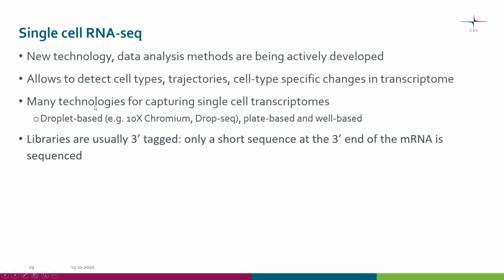There are many lab technologies for capturing single-cell transcriptomes. Some are droplet-based, some plate-based, and some well-based. During this course, we will be focusing on the 10x Chromium data, which is droplet-based. It's important to remember that when we sequence single-cell RNA-seq data, we're actually only sequencing the 3' end, so not the whole transcript.